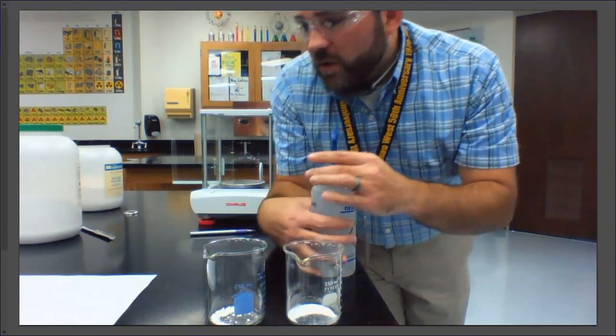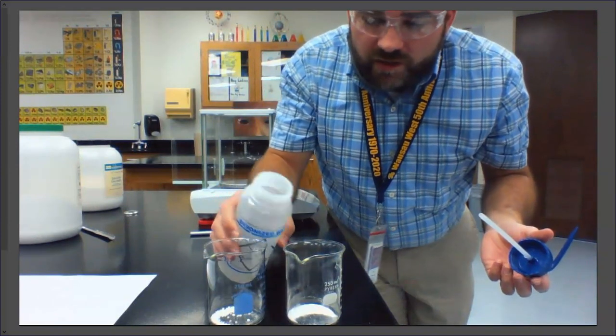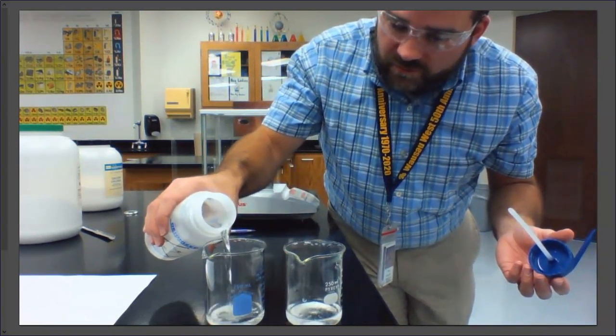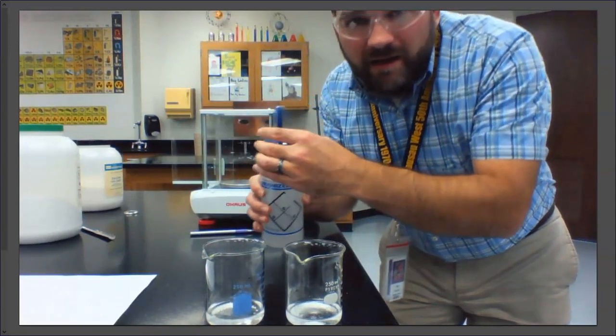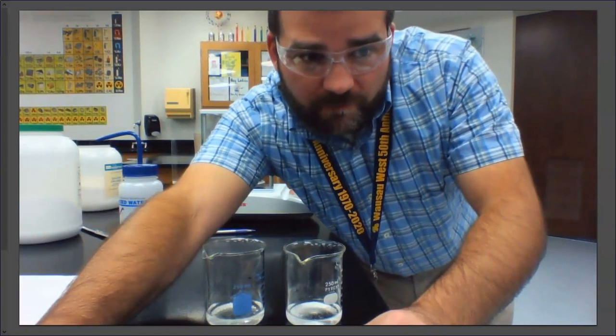My point in putting 20 milliliters on the procedure is to just ensure that you don't use way too much, right? So I'm going to do that. It's about 20 mils. And that's about 20 mils. Again, it doesn't have to be perfect because it doesn't matter how much water I use. What matters is how much chemical is actually there. I'm going to dissolve these and I'll be back.